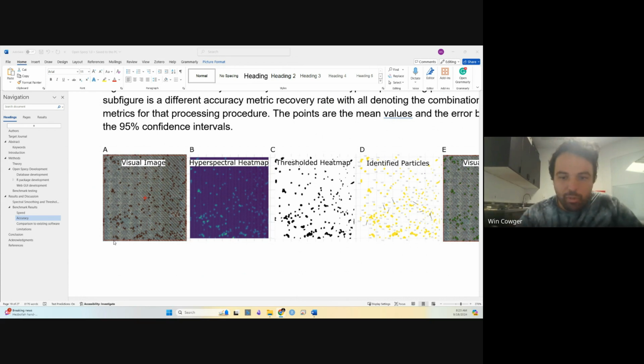No matter what you're using, they are definitely collecting independent spectra across your spatial domain, and then stitching those all together spatially so that you have an image that corresponds to what you would see in a visible image. Is that helpful?